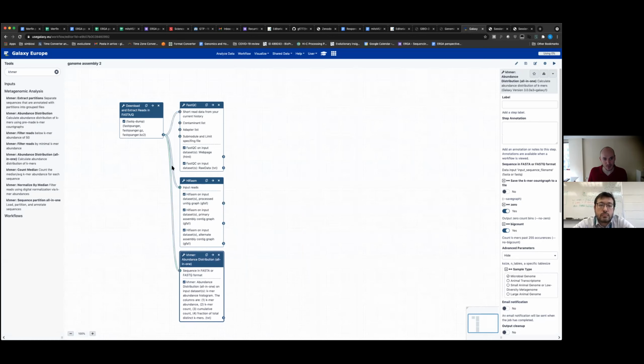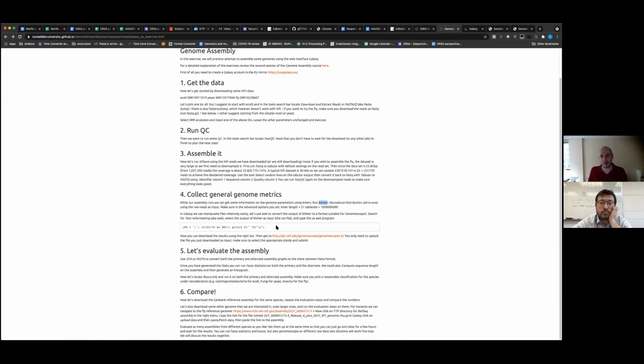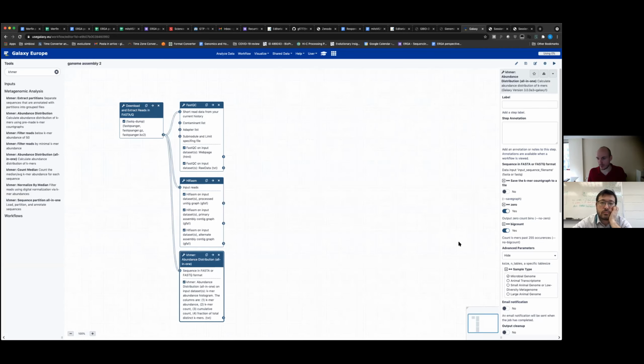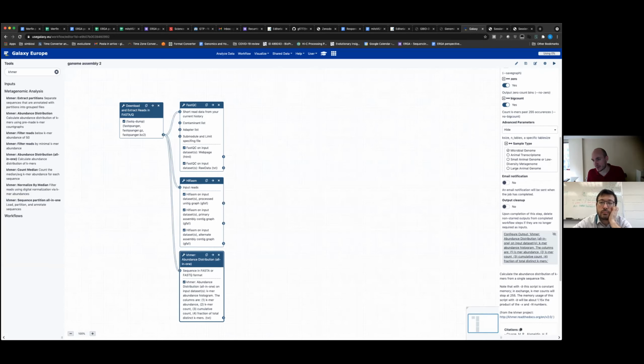So it means that, again, we can run it potentially at the same time as the other steps. Then remember, if you have reached this step on your own, there is some little conversion of the file. But by the way, I have to remember that in this particular case, we want to set some advanced parameters.